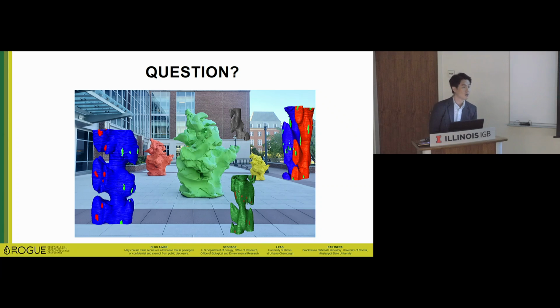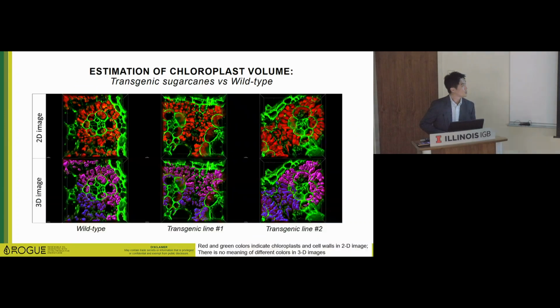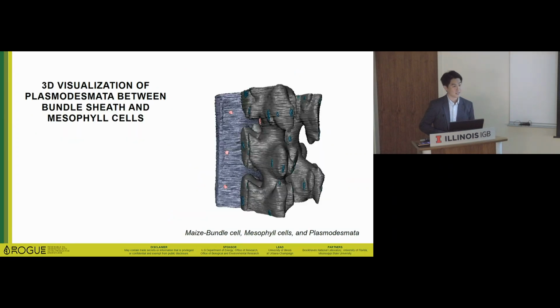Thank you. Can you talk about the sample preparation before you do the microscopy? I guess the first microscope that you talked about? The SBF-SEM. Yes. SBF-SEM is, Kingsley has more expertise than me. So I'll just simply tell you, we have a fixing solution. We cut the live leaf samples and put them in the fixation solution. Then we do the fixation and drying, and then we use the resin. So we fix, and then we mount and look at it.